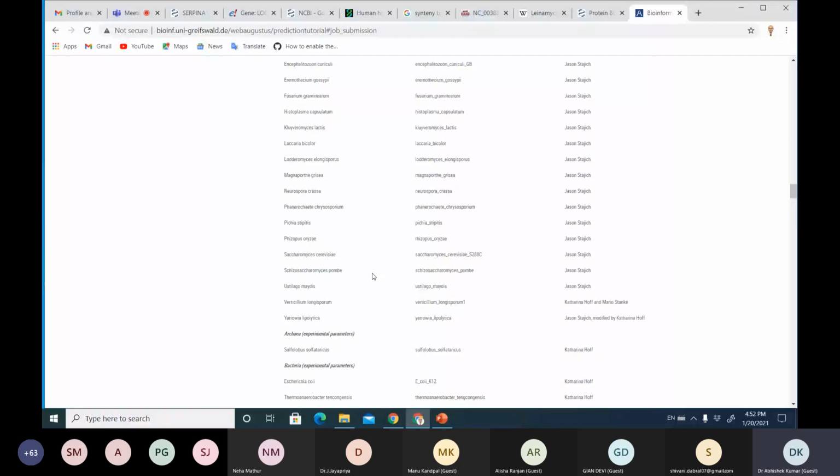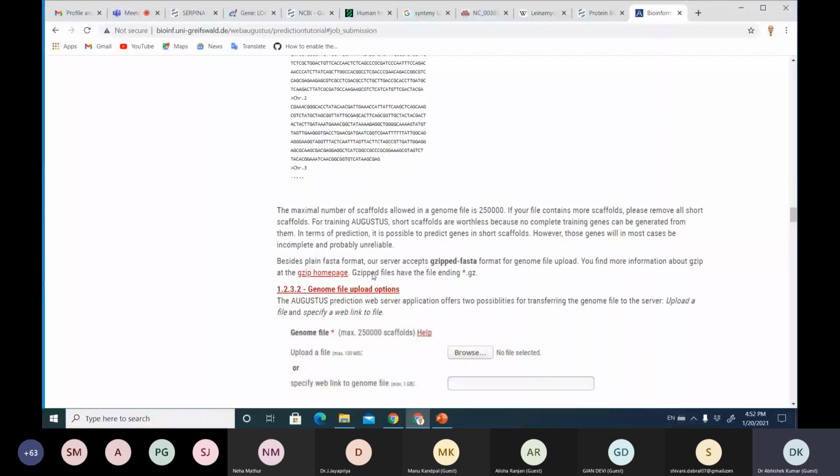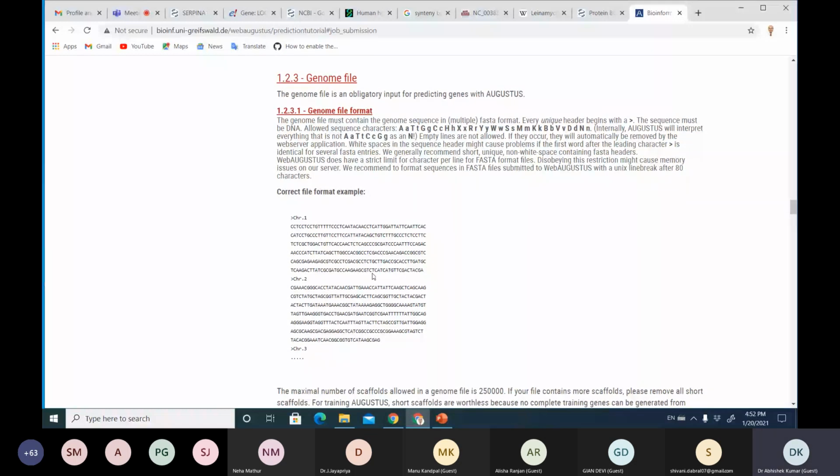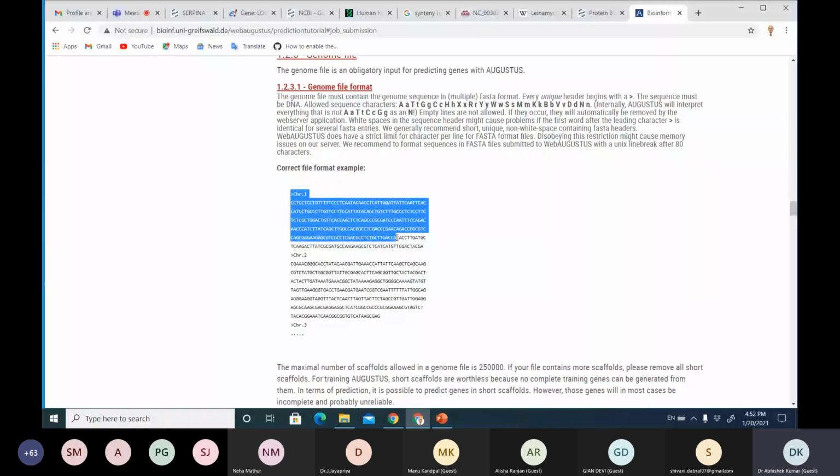So genes for human will be different than genes for fungi, because the introns and exons will be smaller compared to human, because human has a lot of repeats and fungi will not have. Therefore you need to provide a hint to the algorithm about what kind of genome, and then you have a chromosome that will be looking like this. So this is what you are filling in.